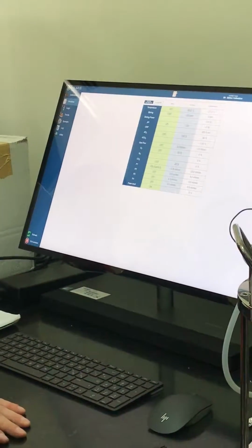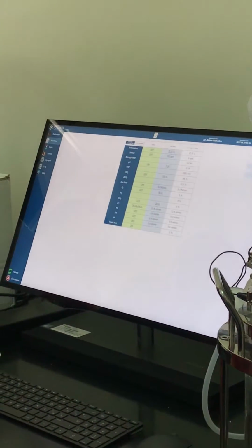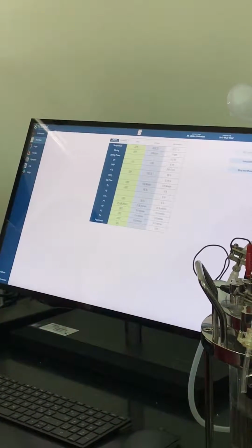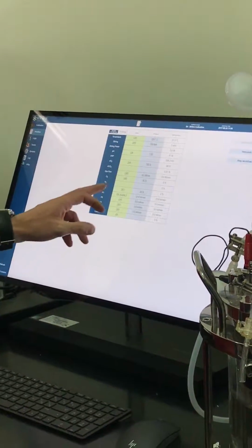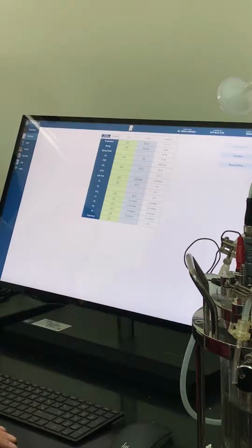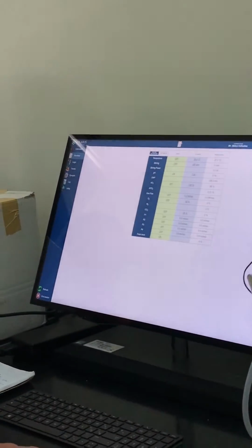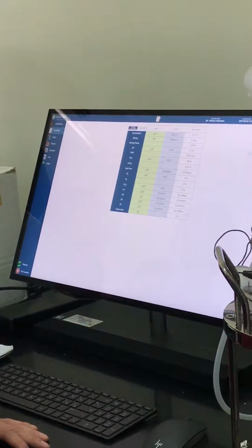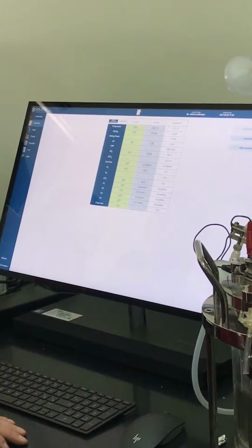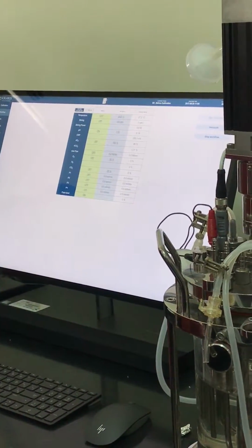Khi mà người ta muốn tăng độ pH, ví dụ như đang 5 độ lên 7 độ chẳng hạn, đúng không ạ? Thì lúc này phải bơm kiềm, bơm P1 nó bắt đầu hoạt động. The right amount of alkali to reach the pH, the set value is given, and to not overpass too much, the set value is given by the PID system, like in the temperature.